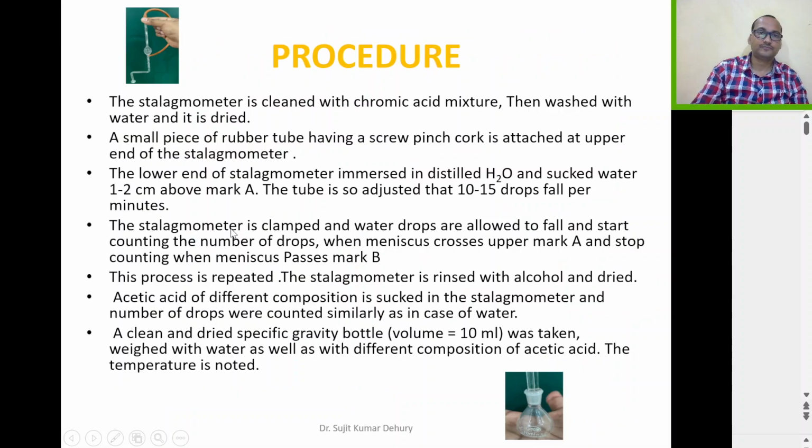So now let's discuss what is the procedure we need to follow for this experiment. The stalagmometer is cleaned with chromic acid mixture, then washed with water, and it is dried.